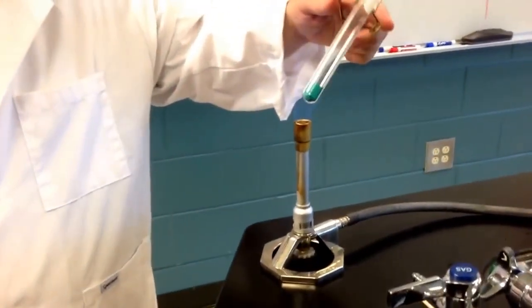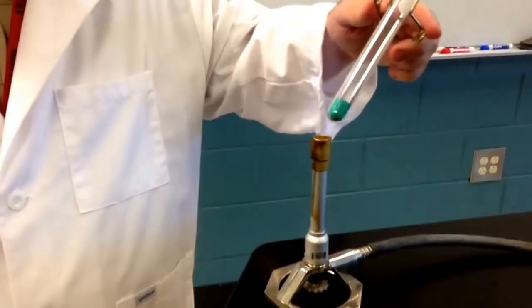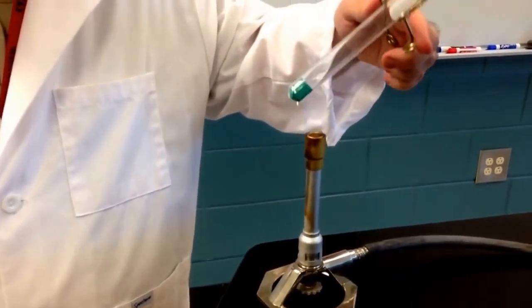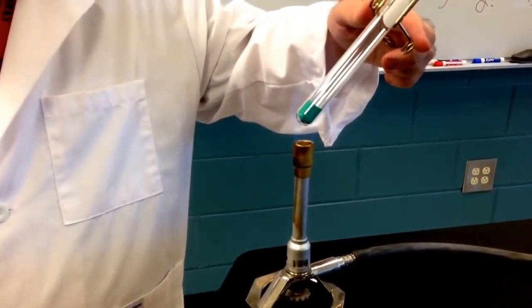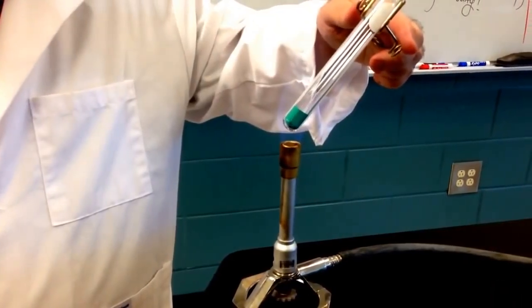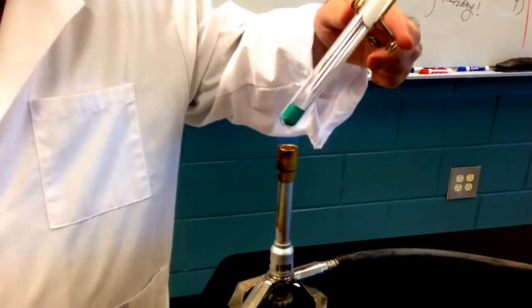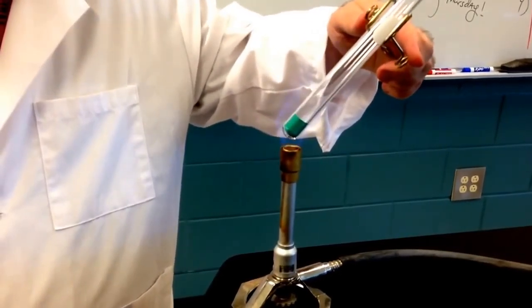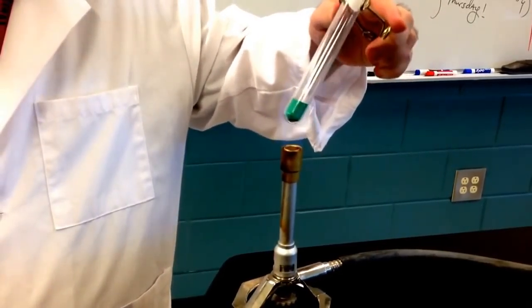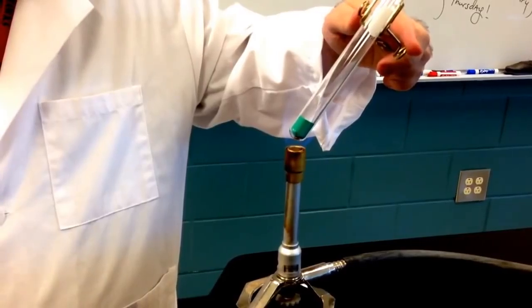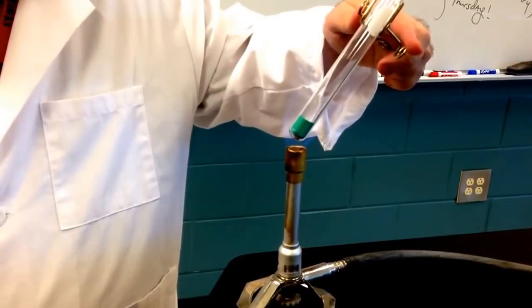Heat the copper 2 carbonate in the flame until you start seeing some movement in the powder. And again, just remember to point the test tube away from yourself, away from others. And it takes just a minute for it to heat up.